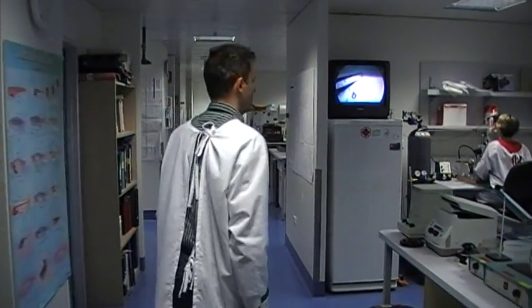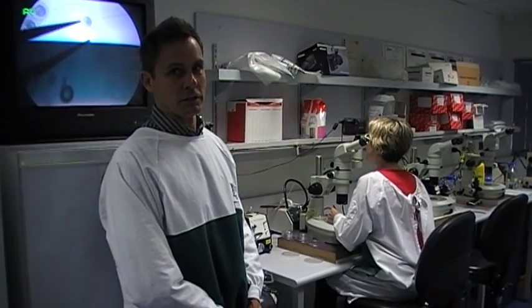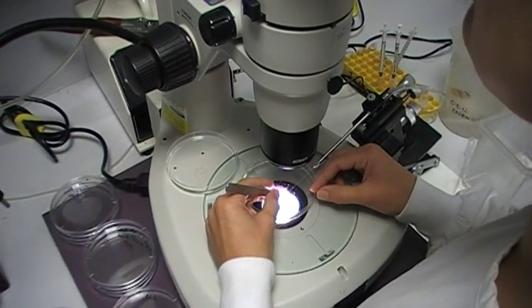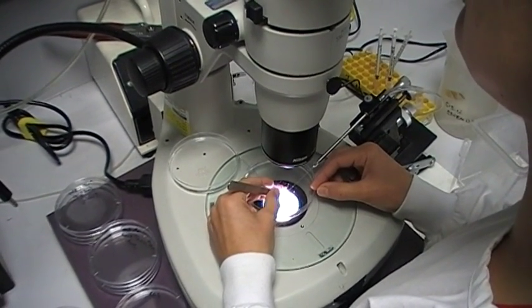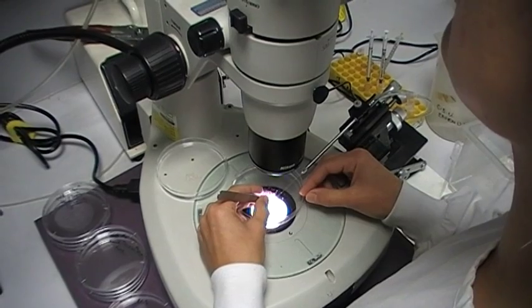And then if you come over here you can see Dr. Morgan Newman who is actually injecting particular chemicals into zebrafish embryos in order to change their gene activity. The camera will now show you how she is basically holding the embryos using some tweezers in her left hand, she brings them up to the needle, and then under the bench she has a foot pump or foot switch that actually controls the pressure and injects the chemicals into the embryos.